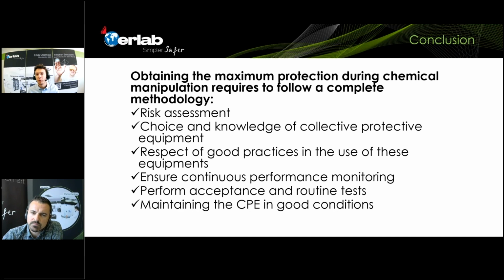And as well, what's important is you have a limited HVAC capacity, so you won't be able to install, for example, 10 ducted fume hoods in the same laboratory, because the HVAC system has to evacuate all these fumes from these 10 fume hoods, and that's just not possible, or very difficult if you don't have the appropriate system. With a ductless system, you don't have a limitation. These are standalone systems. You can place as many as you want in the lab. So that's a really big difference between a ducted system and a ductless system. So thank you for your question.